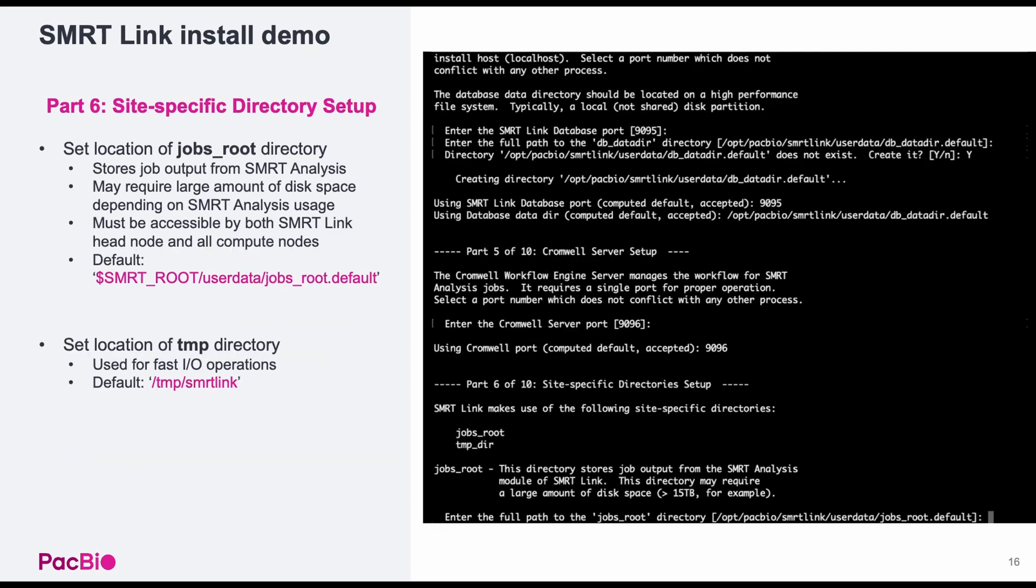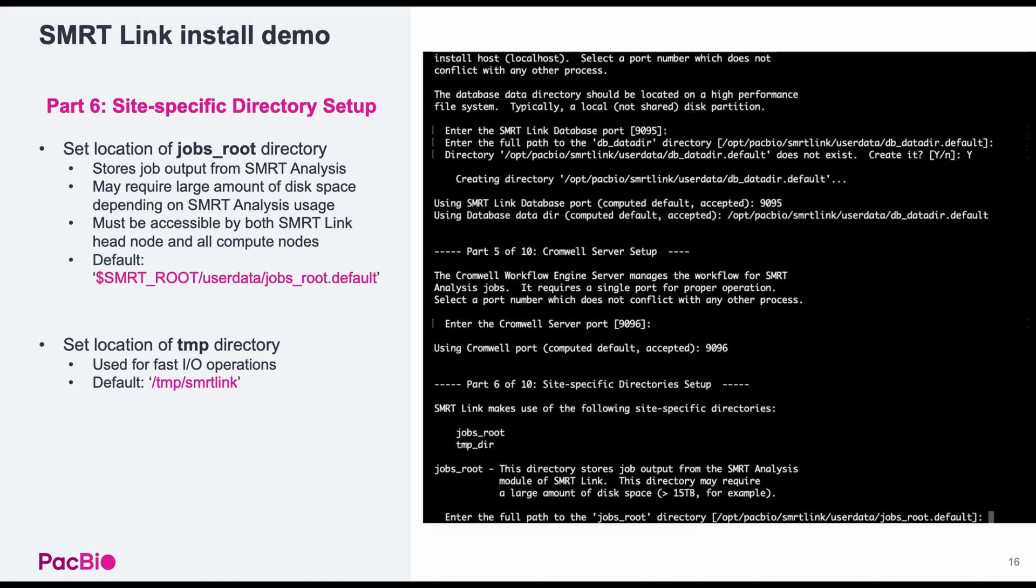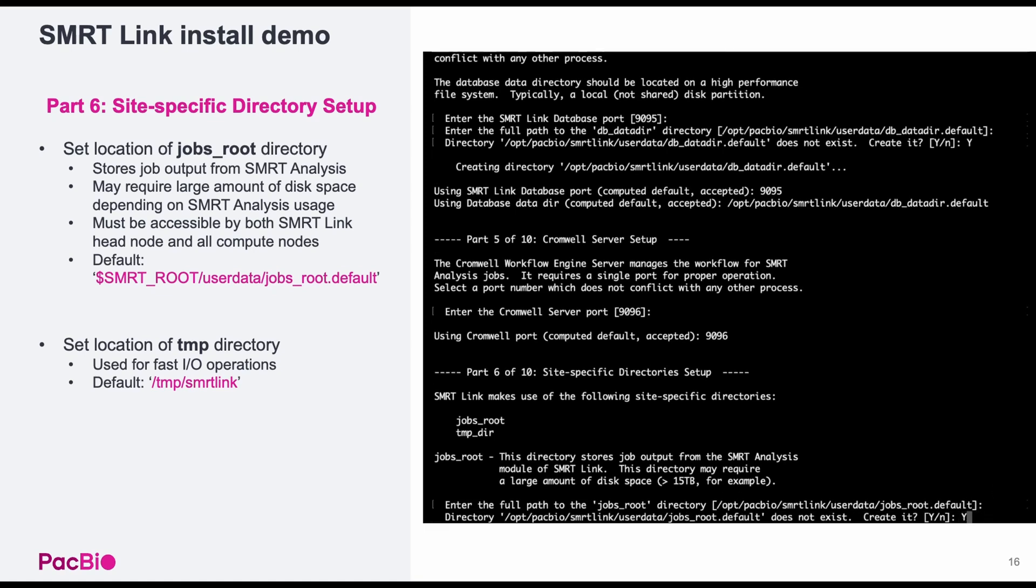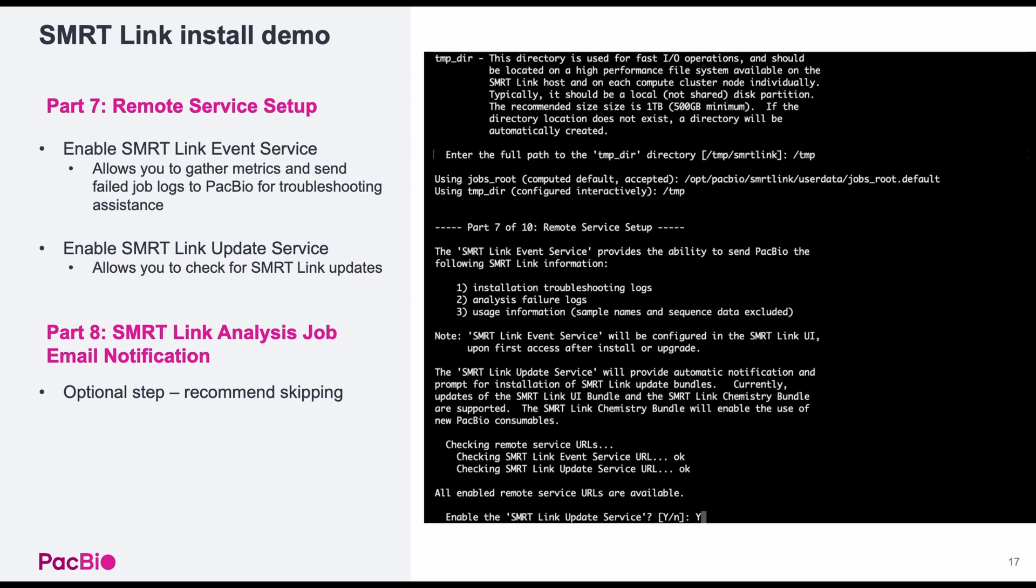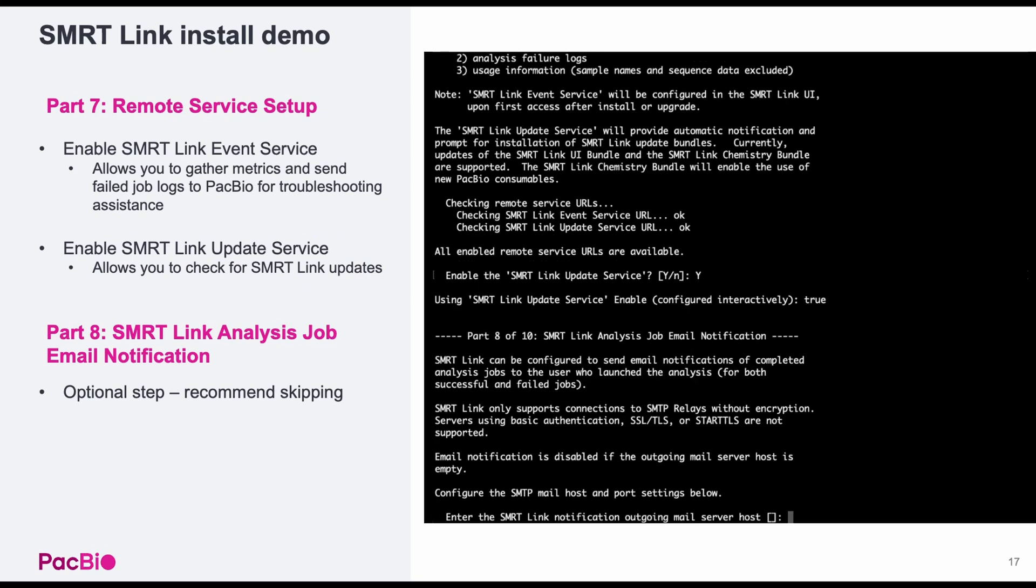Part six is setting up the SmartLink jobs and temporary directories. The jobs directory is where the results of smart analysis workflows will be stored and can become quite sizable depending on the workflows you plan on running. Make sure this location has suitable storage space and is accessible by all compute nodes. I'll be accepting the default location in smartroot userdata jobsroot.default. The temporary directory defaults to /temp/smartlink, but I'll choose to use the root temporary directory instead.